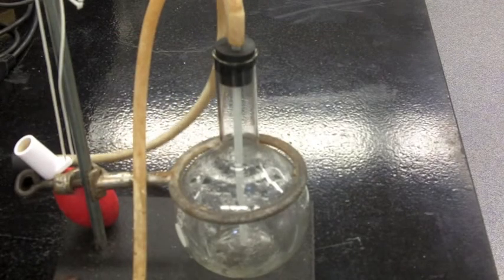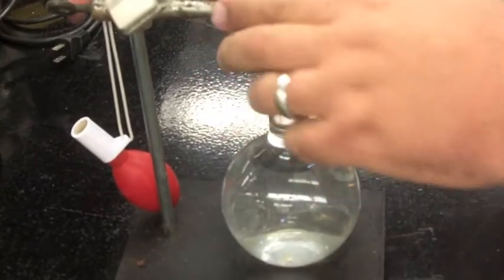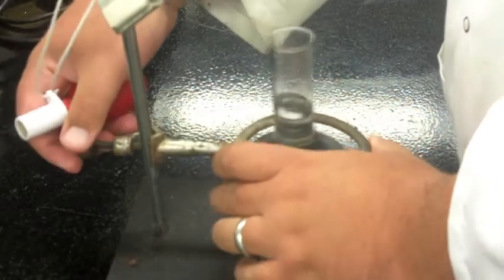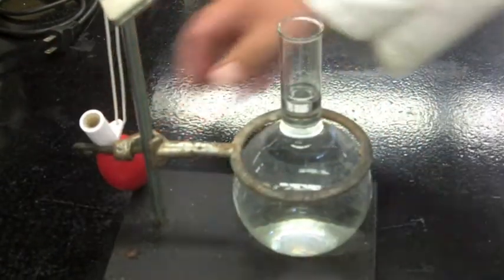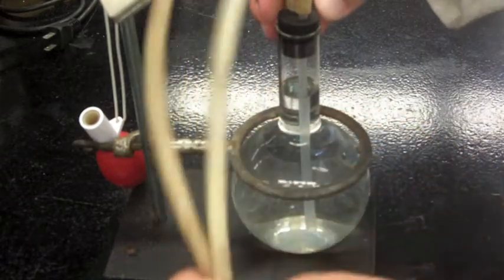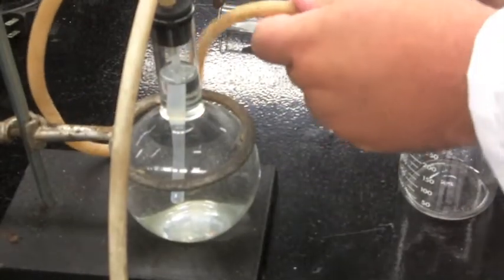So our apparatus is in the manual, but you can see it's this Florence flask, and we want to fill that with water and put the clamp on it, as you can see here. This will be what's displaced to measure the oxygen. This will all be on your bench. There is a stopper with 2 valves, one that's long and one that's short, and you just need to get this set up.